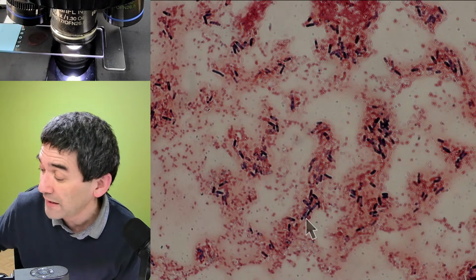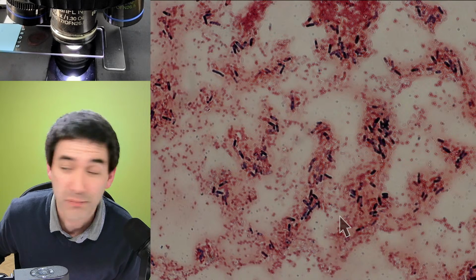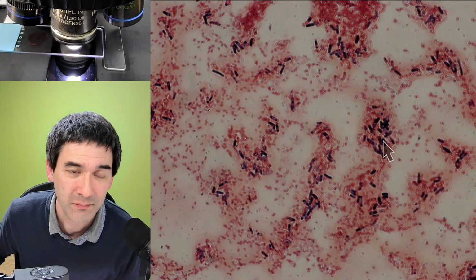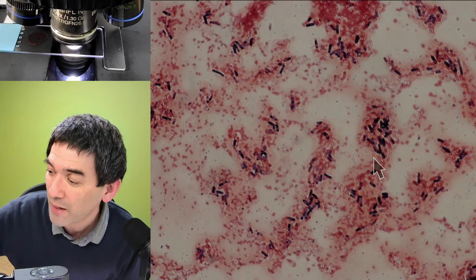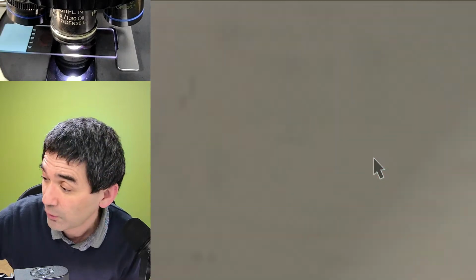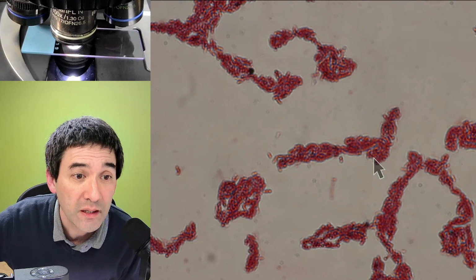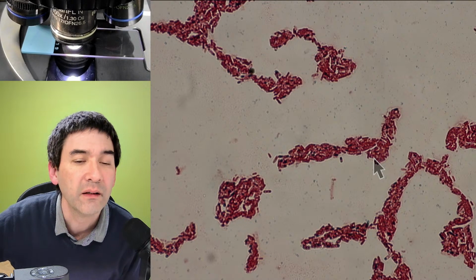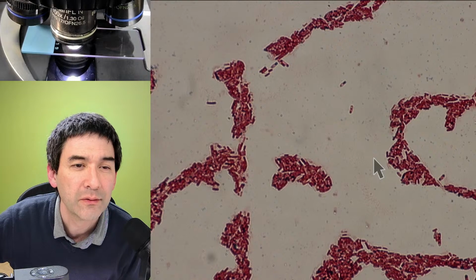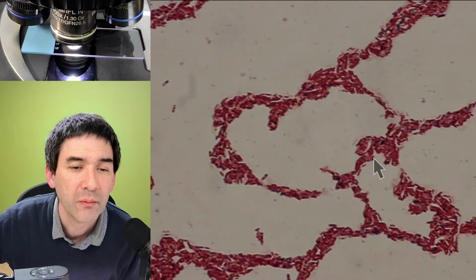Actually, this was the place where I added some E. coli bacteria. So these are gram-negative ones, and because of so many contaminants on the plate, these are the other ones. So I'm going to now move over to the other side. I hope that the oil film doesn't rip. Okay. And they are also gram-negative, but you see that the cells are a little bit bigger. They're also rods.